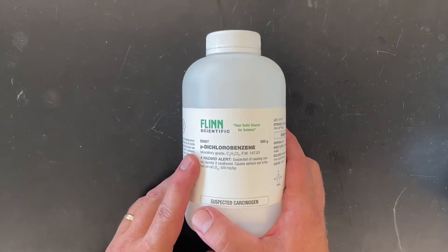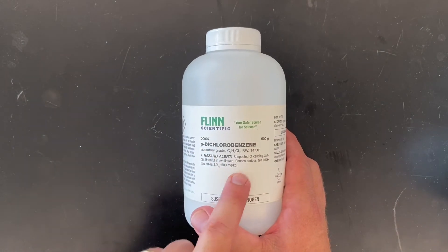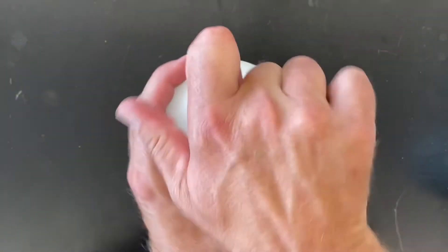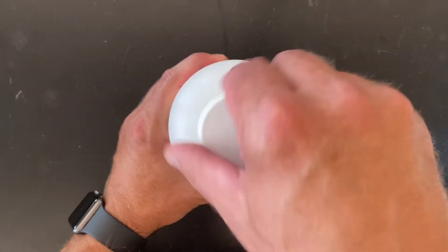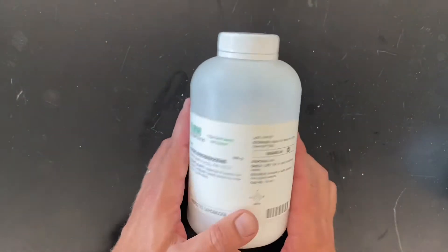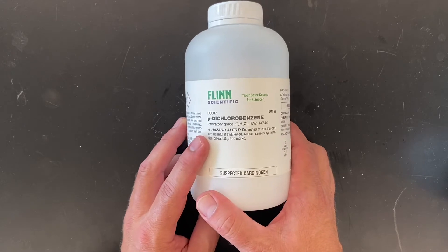Then we have some dichlorobenzene — the 'p' stands for paradichlorobenzene. It's related to a whole series of chemicals, one of which you might recognize the smell of — it smells a little bit like mothballs. Dichlorobenzene is actually one of the components of mothballs, along with its more offensive cousin naphthalene, which we also have some of but didn't order more of.